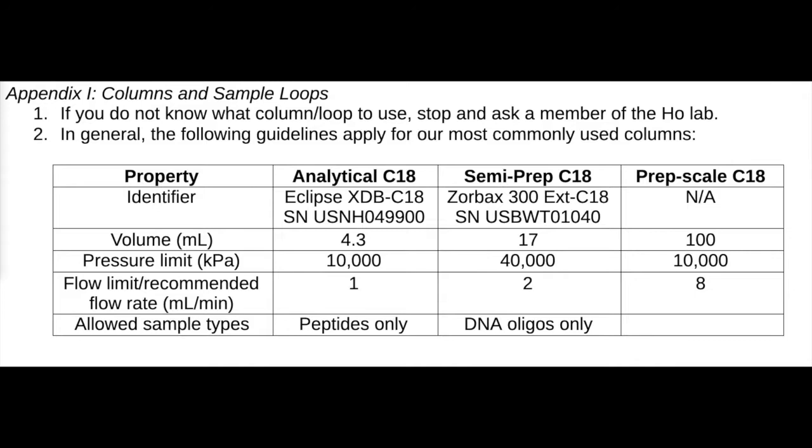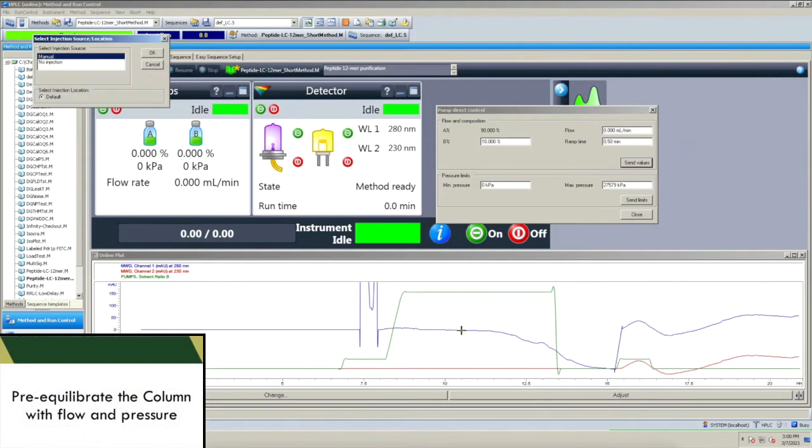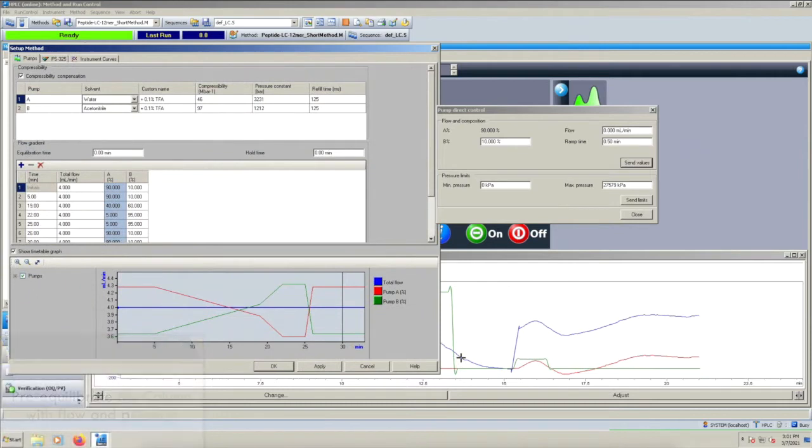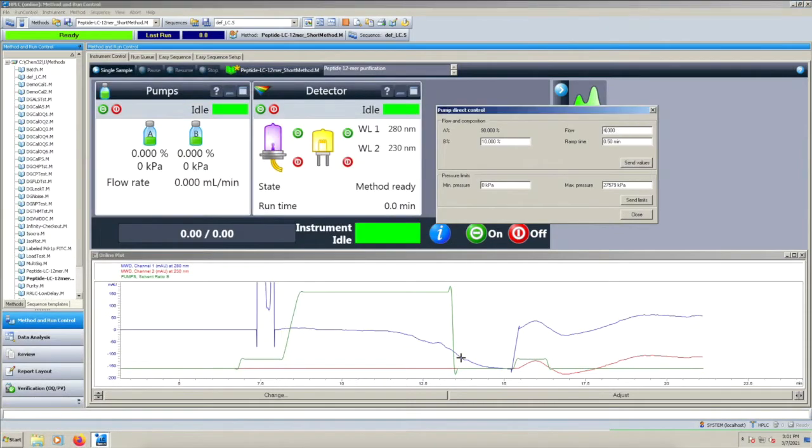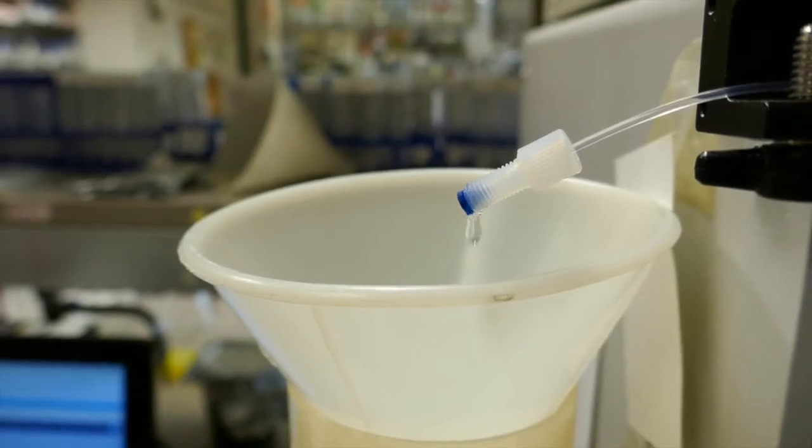At this point, you should check your method and make sure that it is what you want loaded for whatever you're going to be purifying on the system. Then we're going to pre-equilibrate the column over a 5 to 10 minute period. Bring the flow rate and the percent acetonitrile that you have in your first step of your method up to that point.